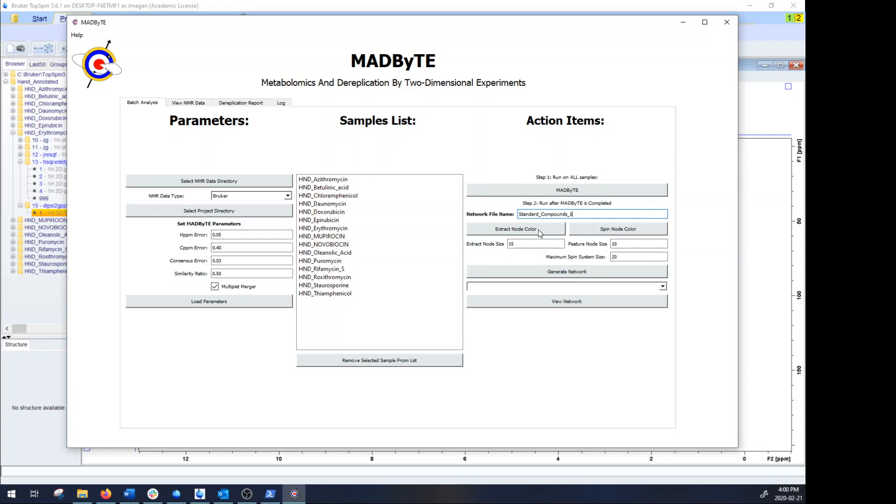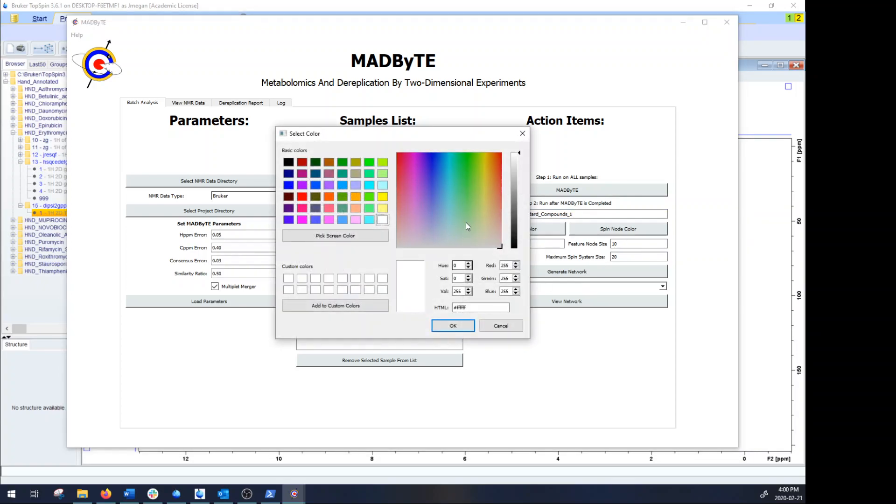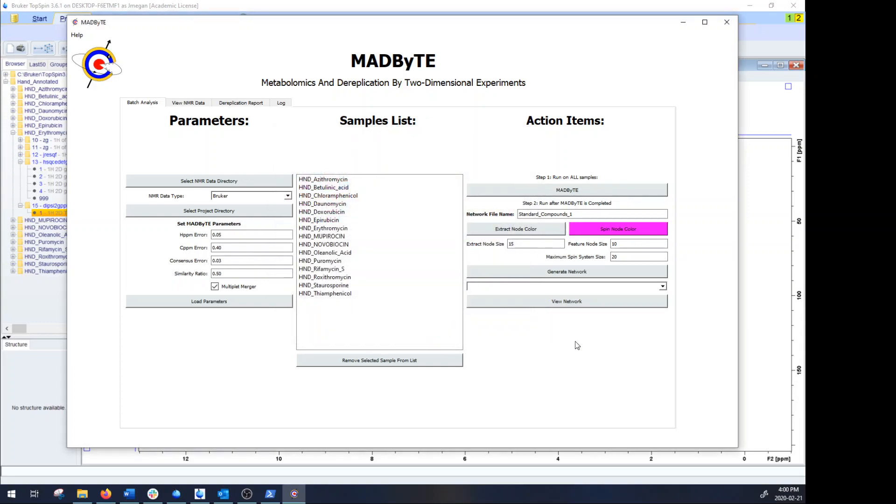You can select what sorts of colors you wish to have. The extract node color you can change, or you can change the spin node color. So for instance if we wanted to see a very vibrant network I could change the spin code to that color, very hot pink.